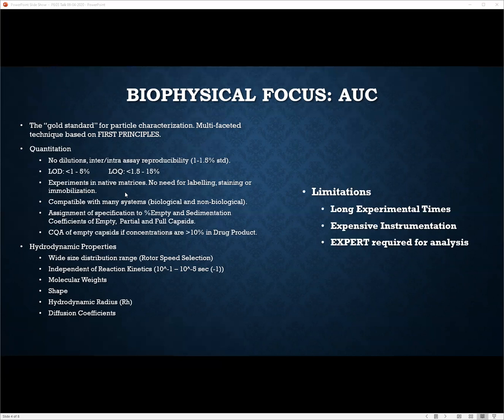In addition to that, there are known limitations, and these are the commonplace limitations which most people refer to when talking about AUC. They are long experimental times, depending on your rotor speed. It can be overnight, 4 to 8 hours. It's expensive instrumentation, and the data analysis requires some level of expertise.